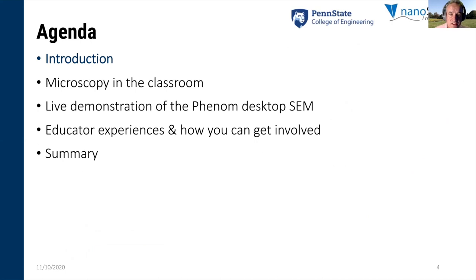The agenda for today's webinar is right here. This is the introduction period, obviously. Dr. Gray is going to be talking about microscopy in the classroom. He's then going to do a live demonstration of the Nanoscience Instruments Phenom Desktop SEM. We're then going to go to our panel and talk about some educator experiences using remote access and how you, as the people attending today, can get involved. Some of you may have already. And then we'll do a quick summary.